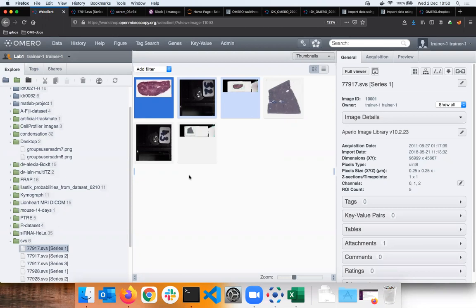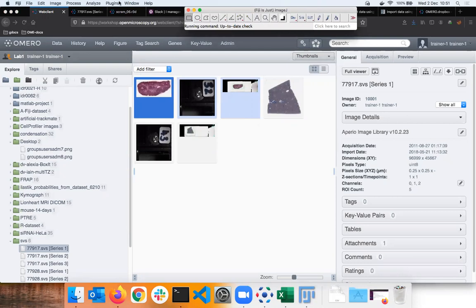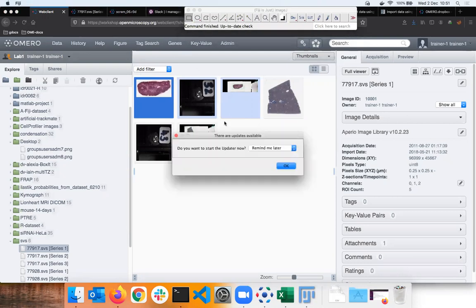So we have a server which is remote here in Dundee, and then we have a local application called Fiji. I hope that you all know Fiji, ladies and gentlemen, and we have a plugin for Fiji. This is like a software glue which uses the OMERO API, and it runs under Fiji. I sent you an email previously saying that you might be interested in installing Fiji, and if you've done so, that's the moment when you please start your Fiji and work with me on that workflow, which is again described in the OMERO guides and in your workflow.